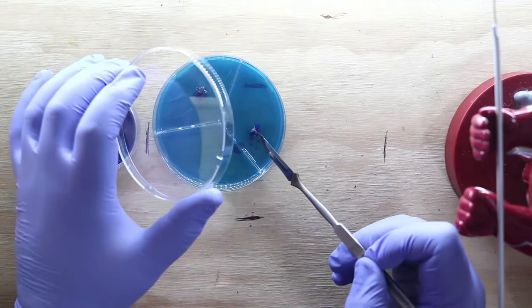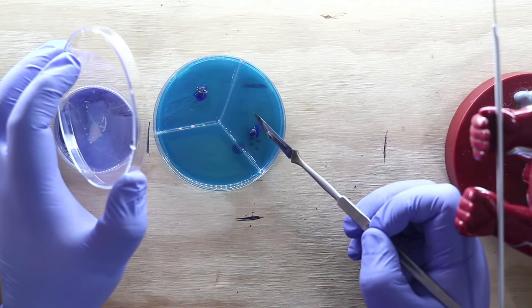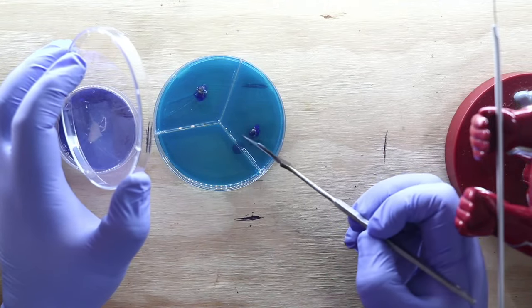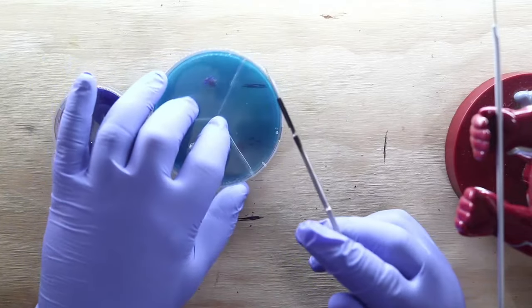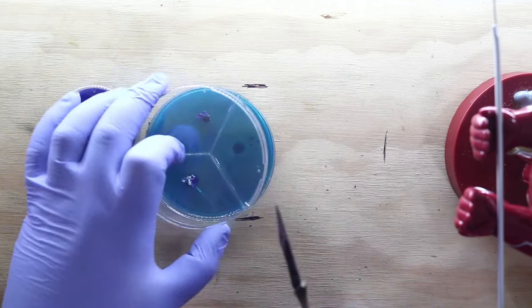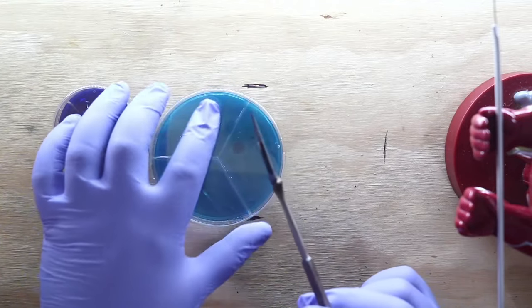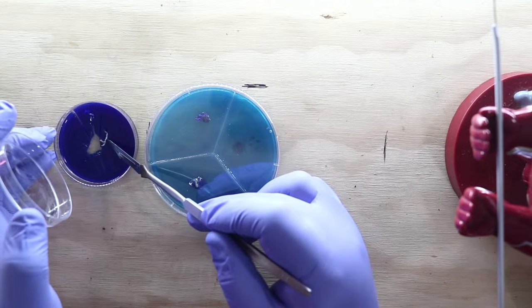Now, as the mycelium grows, like I said, it can leap over these little canyons that I've created, but the bacteria can't, which will slow the bacteria down and allow me to collect a clean sample from further out if it's needing to run from the bacteria. I don't use any antibiotics in my agar. I think antibiotics hide weak techniques. Yeah, we always say the best tech is technique. Yep. The best tech is no tech. The second best tech is technique.